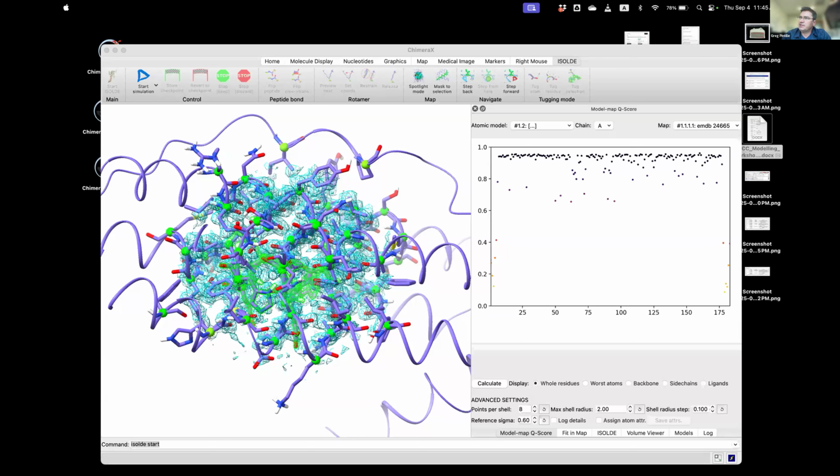It's funny because cross correlation is very simple to implement generally, but for Q-score there was just this slight technicality of looking at points that are close to one atom but not others, which was the main bottleneck. And this was again to try to focus on one atom at a time. And this was the part that made it a little bit tricky to implement. So it's not the easiest implementation, perhaps. I'm not sure if they haven't released it because they had issues with it or something else.